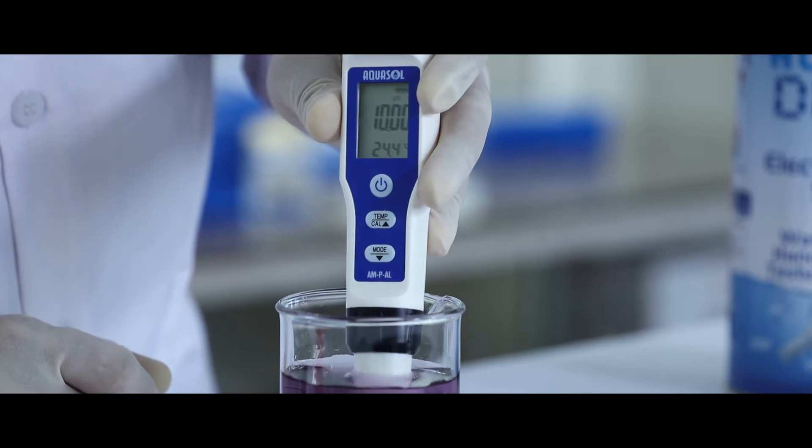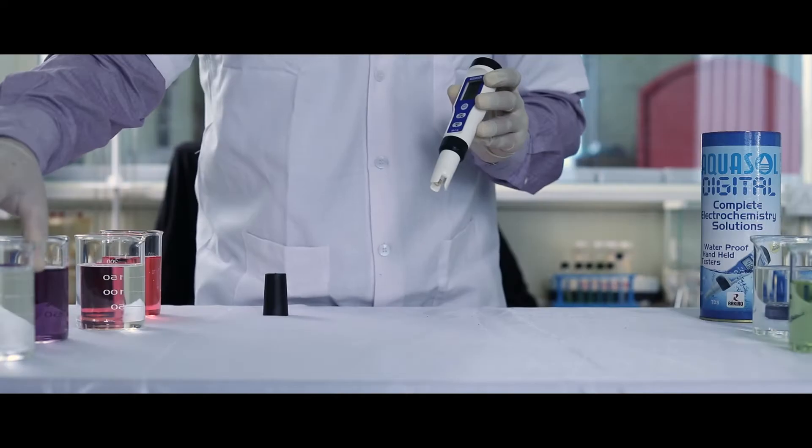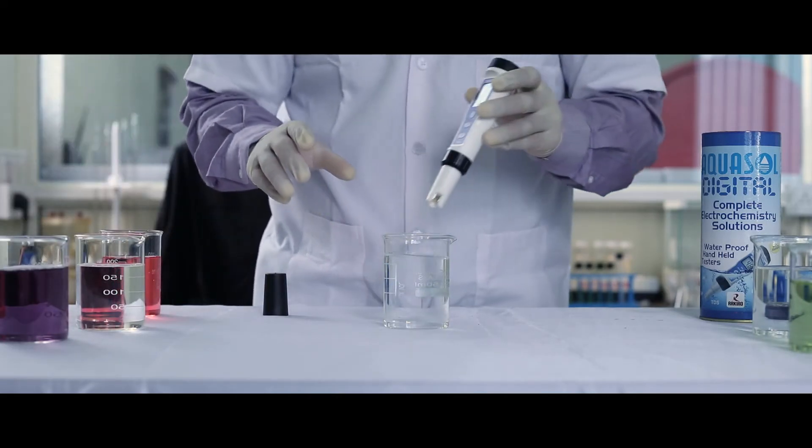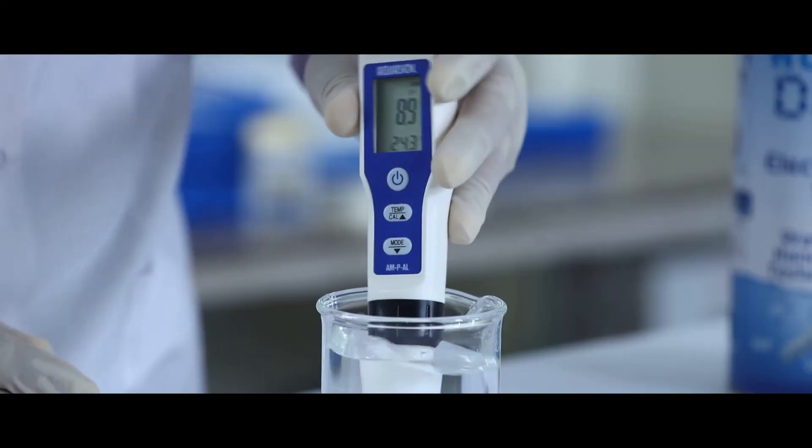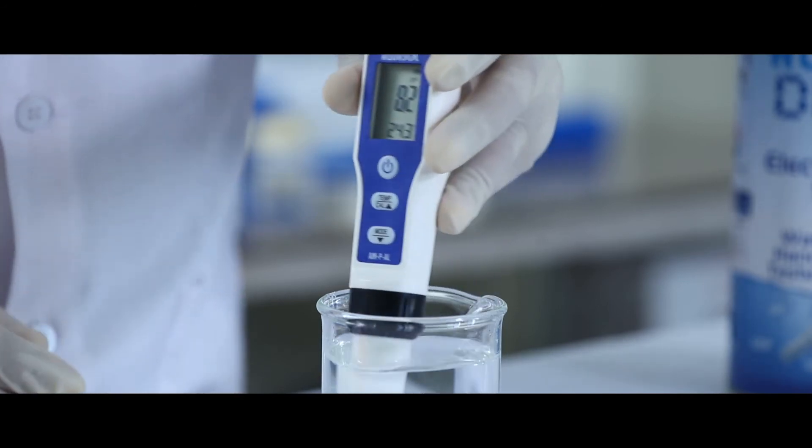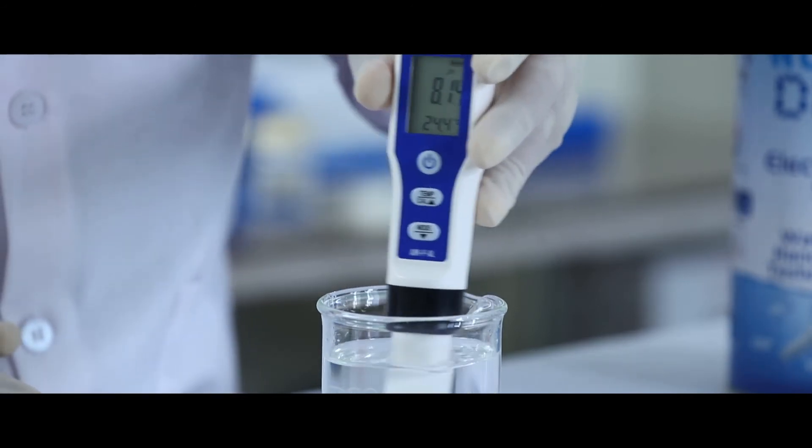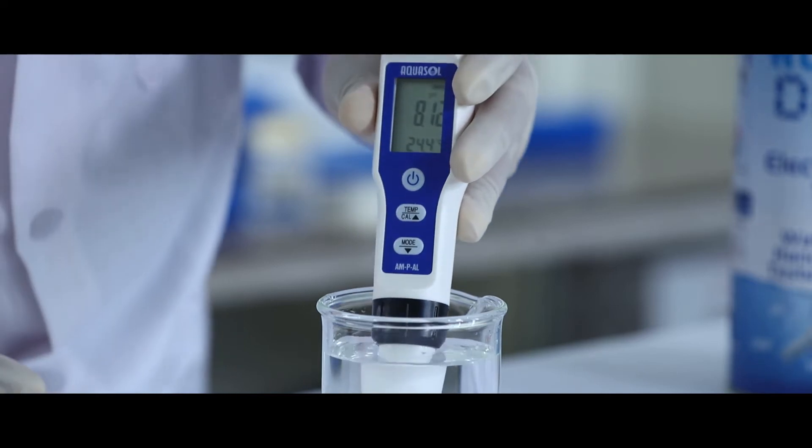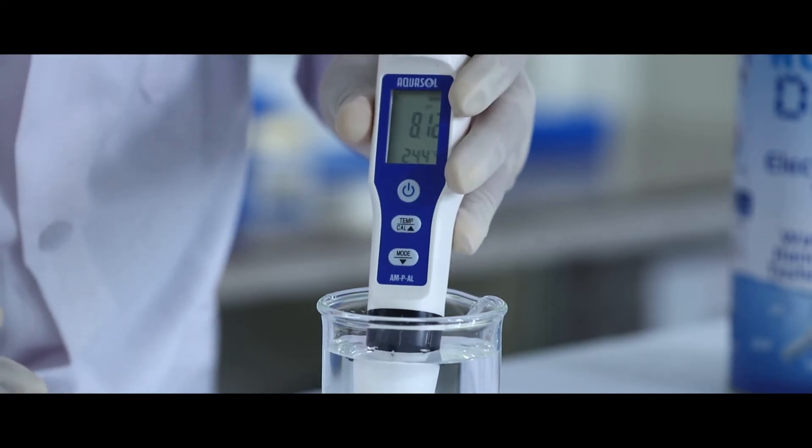Once all the calibration is done, the meter is ready to test samples for pH. Dip the electrode in the sample. Stir gently for stable reading. Note the pH value of the sample.